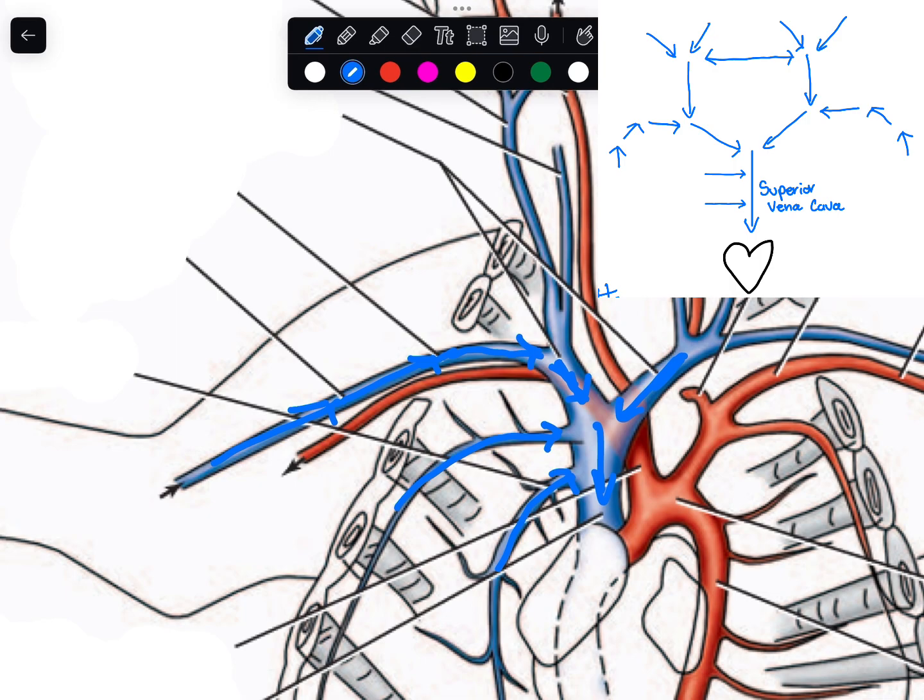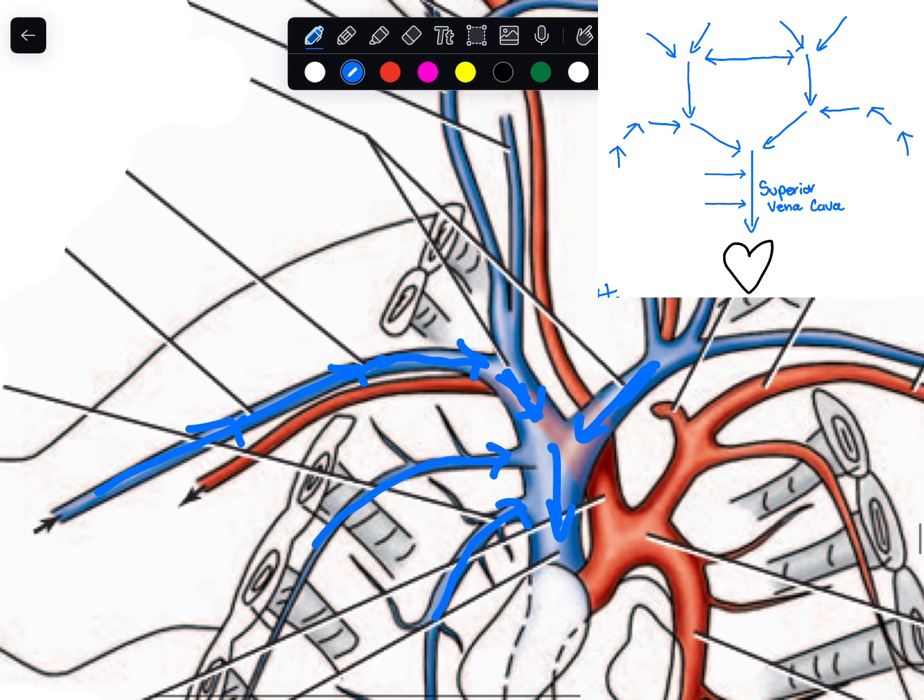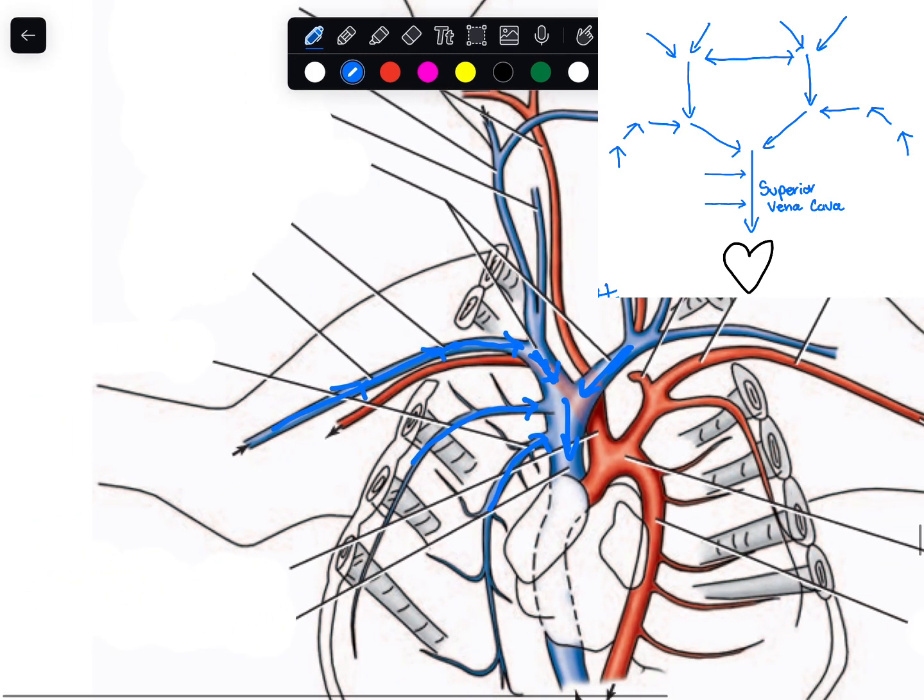One thing to memorize so you don't confuse these three: the axillary is typically under the armpit of the cat. And the brachial vein is easier to tell because it's literally in the arm of the cat, right? And then the subclavian vein over here is also typically closer to the ribs right here, as you can see. Sorry, that took so long to take out, but yeah.